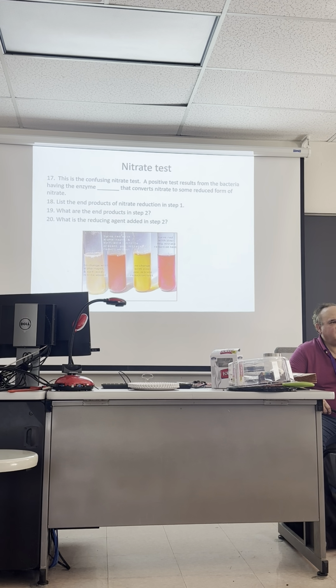With just sulfanilic acid? Yeah. I can't explain that. Probably you didn't add naphthylamine and thought it was sulfanilic acid, because naphthylamine is a little pinkish in color as it is. So if you added naphthylamine without the sulfanilic acid, it would have turned a little pink.